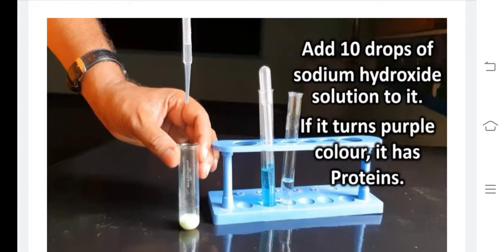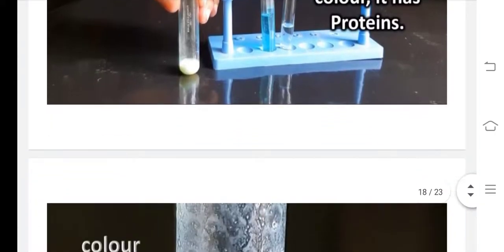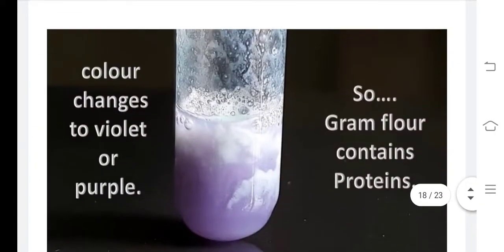Any doubt? What are we adding in order to check the starch? Iodine chemical, right? It is an indicator. What about this? Sodium hydroxide and copper sulfate. See, they are adding it in order to check the proteins. I hope you understand. So what are the tests? Starch and proteins. Remaining energy giving food is fats. This you already know very well. Clear? Observe this color change. Color changes to violet or purple. Then the gram flour contains proteins.